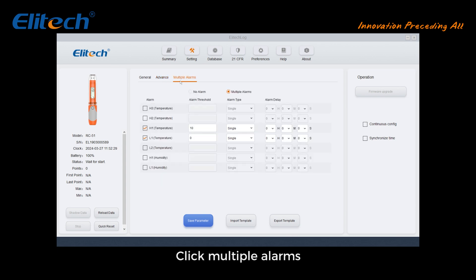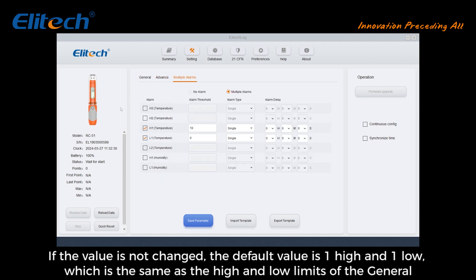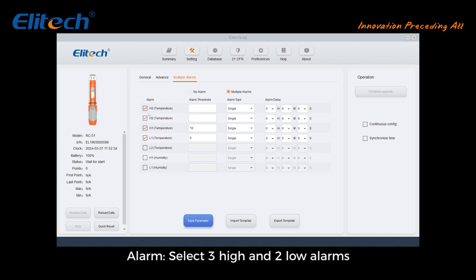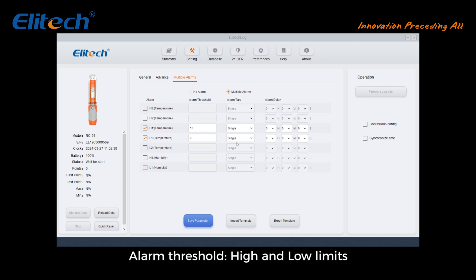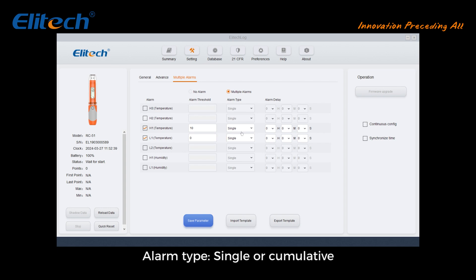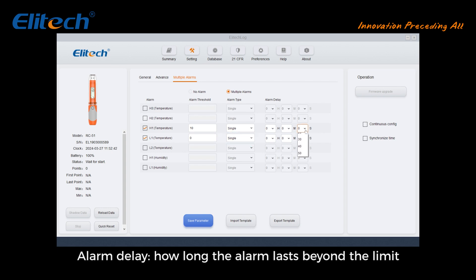Click Multiple Alarms. If the value is not changed, the default is one high and one low alarm, which is the same as the general alarm high and low limits. You can select up to three high and two low alarms. For each alarm, set the threshold high and low limits and the alarm type: single or cumulative.